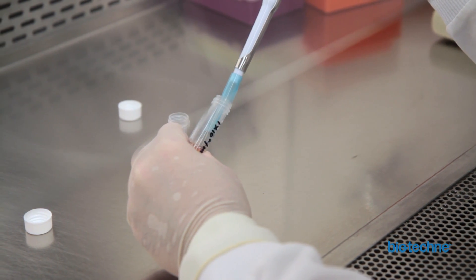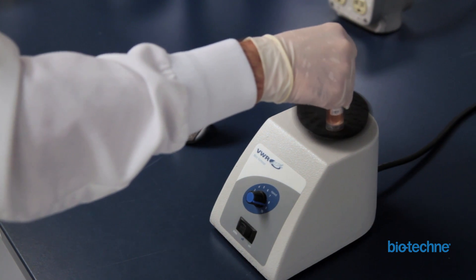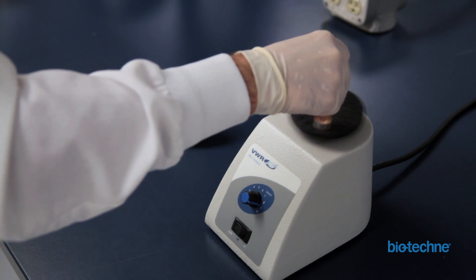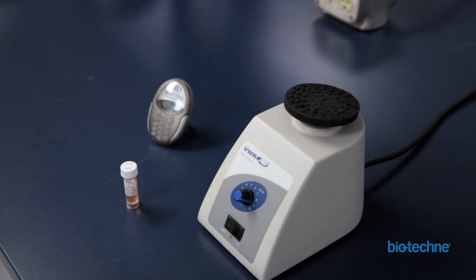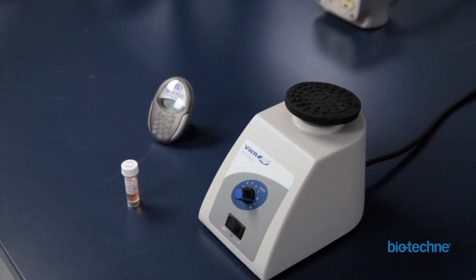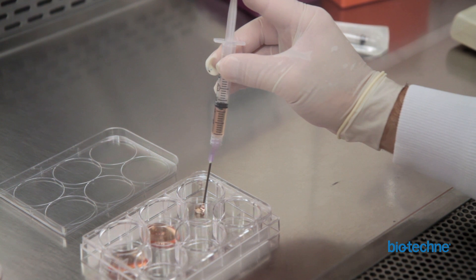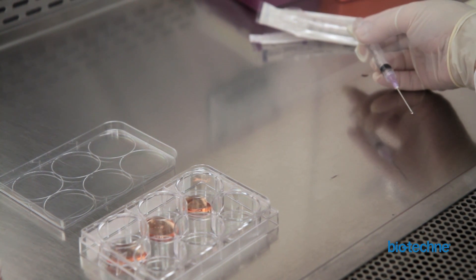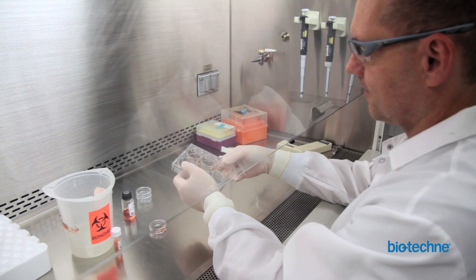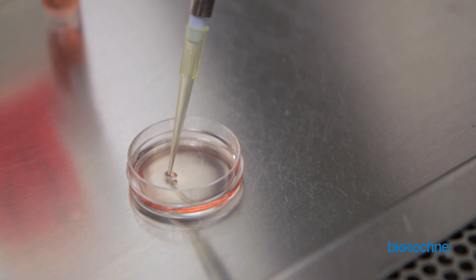Add the appropriate volume of cell suspension to the methylcellulose aliquot and vortex vigorously. Depending on the specific assay and media requirements, supplements and cytokine additives may be required in the methylcellulose prior to the addition of cells. Allow the air bubbles to escape by placing the aliquot at room temperature for 15 to 30 minutes. To plate the cells, use a sterile 16-gauge needle with a 3-milliliter syringe. Add 1.1 milliliters of the final cell-media mixture to each 35-millimeter petri dish or each well of a six-well plate. Make sure to use non-tissue culture-treated plates.